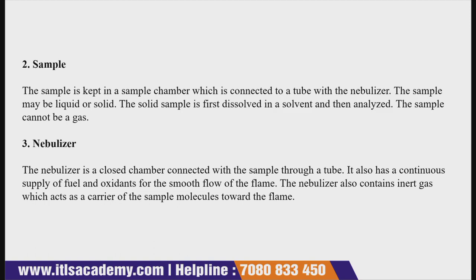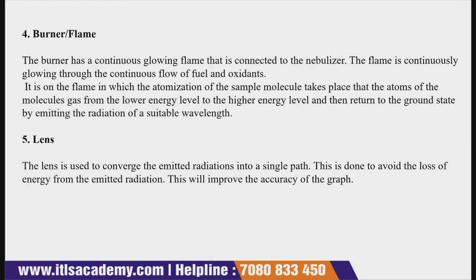If you want a very smooth flow of flame, there should be a continuous supply of fuel and oxidant. That is the reason the flame will be smooth.